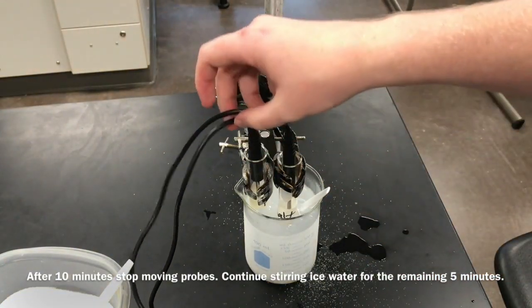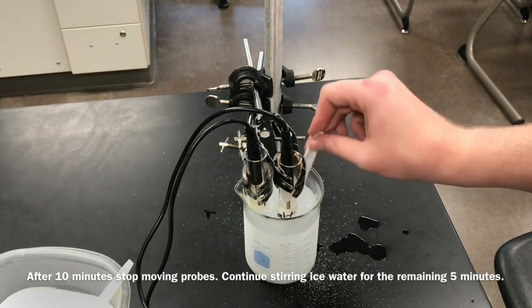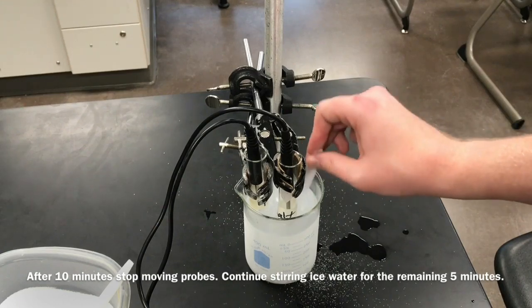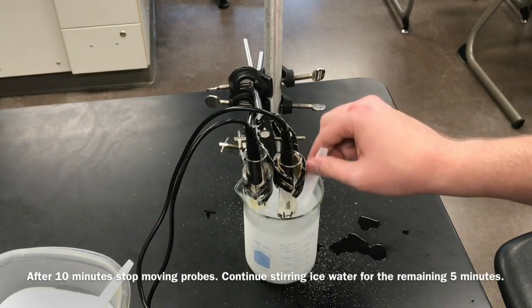Now you're going to stop bobbling this, so you don't want to do this anymore. Stop doing that. You're still going to stir for the last 5 minutes. So this is really important. It's 600 seconds or 10 minutes. You've got to stop moving this, and we're just going to be stirring for the last 5 minutes here.